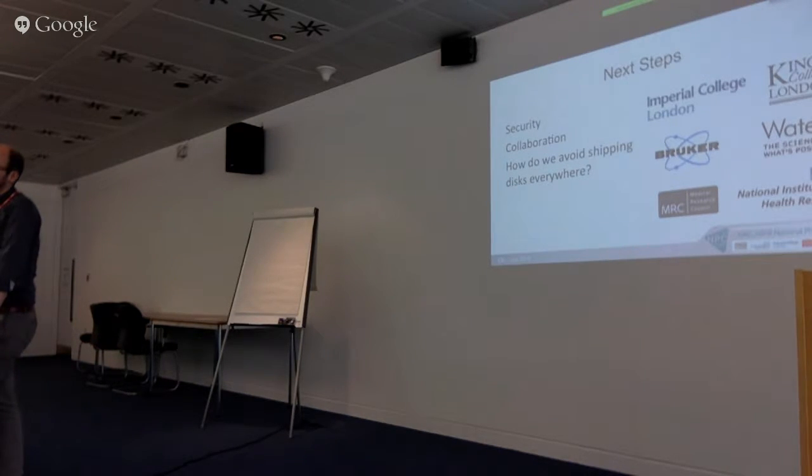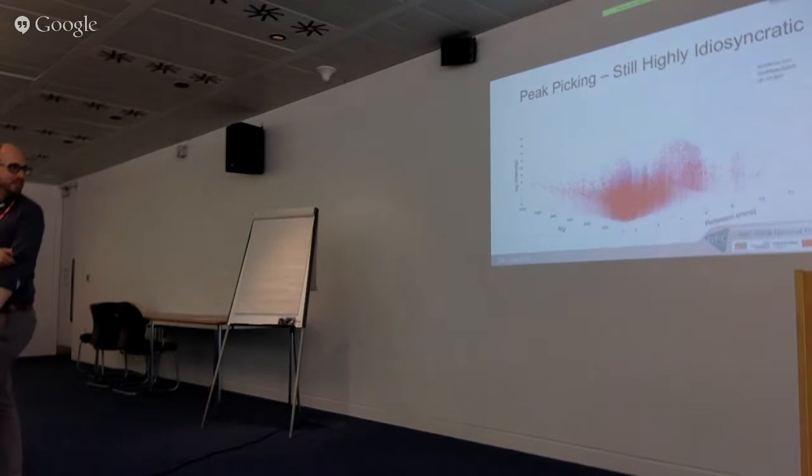So do you think that the standard compression algorithms are not going to help? I would argue that there's a lot in the data set that we can afford to throw away. I would say that when you look at all this, there's a lot of noise in the end.